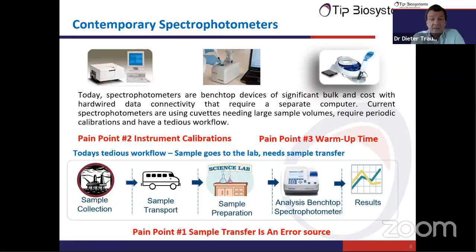First of all, it takes quite a very long time. The workflow is stationary, so you need to go to the lab. And for certain samples, your sample transport can cause quite a big error.